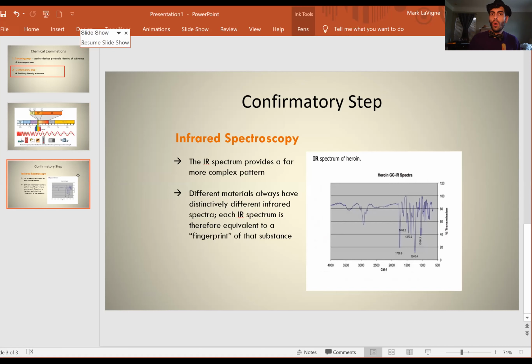So what's going on? I want you to think of this candle here as IR radiation. You see those little lights? So that might be my IR radiation or my light source. All right? And we'll put the drug on the lid here, Yankee Candle, thank you. Copyright, I don't know. I hope I don't have to pay them now. Ooh, I don't got money for that.